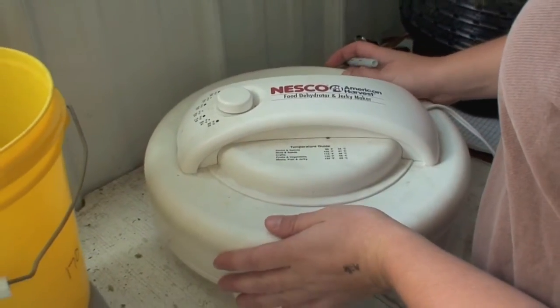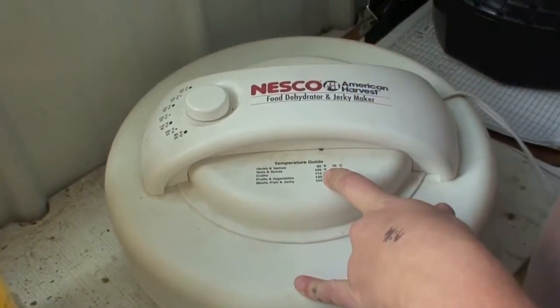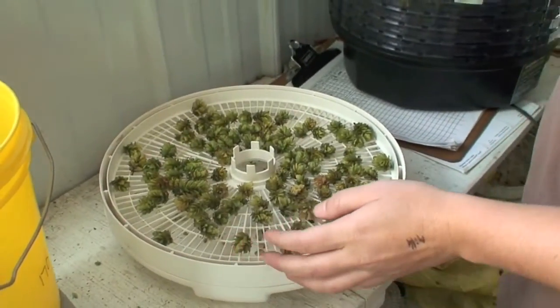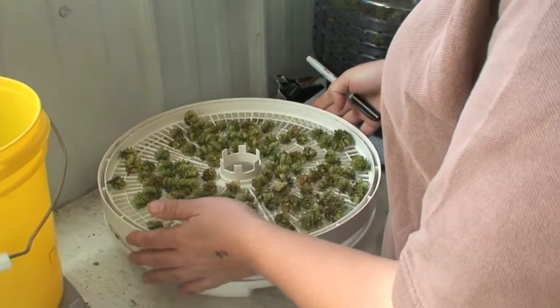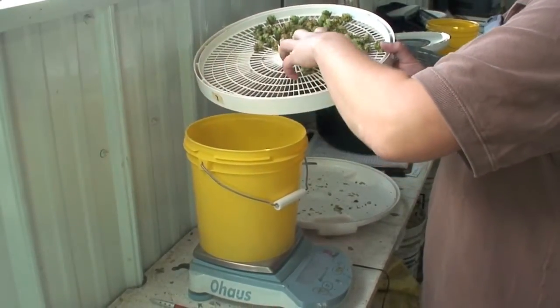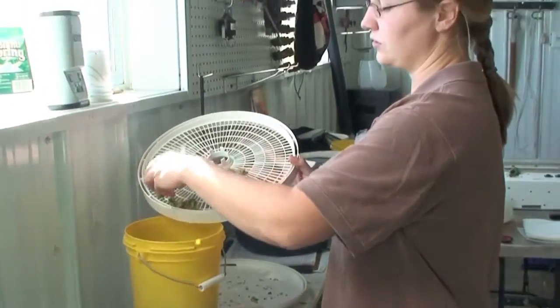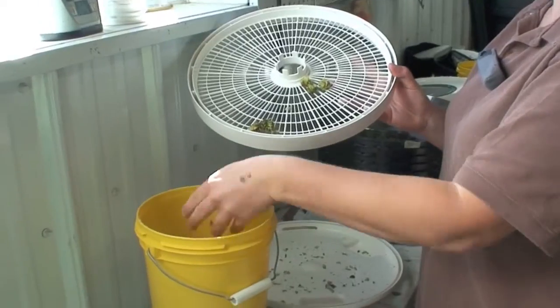This is the dehydrator we've been using. It goes up to 155 degrees Fahrenheit and we just leave it overnight. It's very safe to leave on, which is part of the reason we like it. When you take the cones out, make sure you don't lose any of them — they're very brittle when dry. You can tell the cones are completely dry because they're very crumbly and pretty much disintegrate when you rub them.